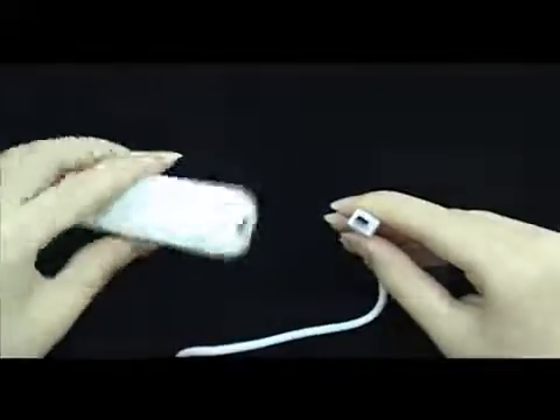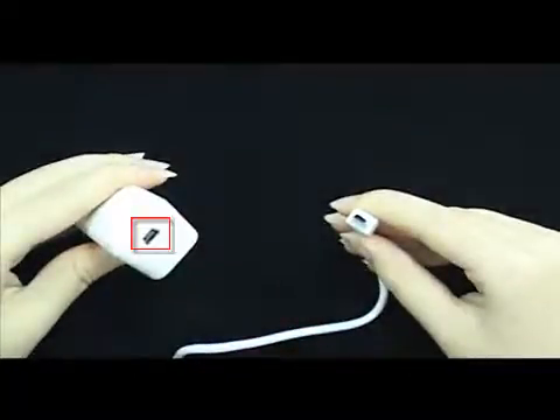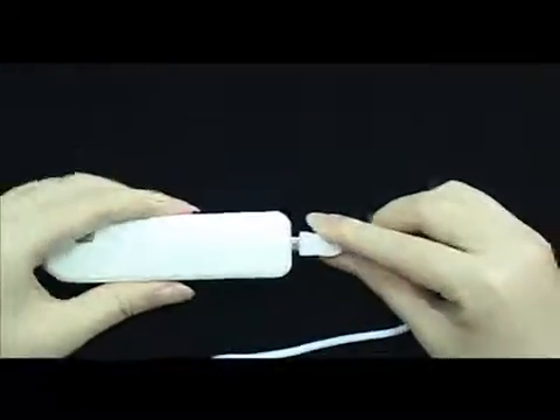Insert the program first, then connect USB to the microscope. Select the Connection button to preview the screen.